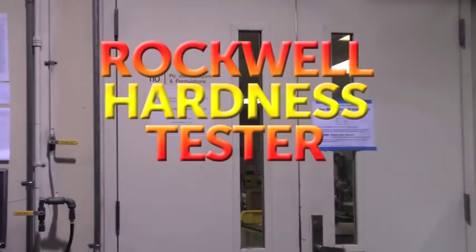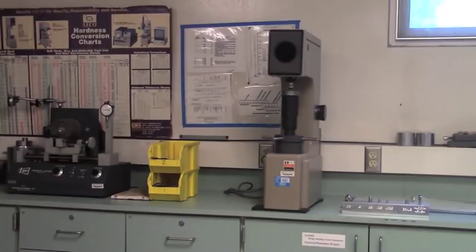The Rockwell Hardness Tester is located in room 110 of the Plastics Analysis Laboratory. The purpose of the Rockwell Hardness Tester is to use ASTM standards to find an accurate hardness measurement for the desired workpiece.